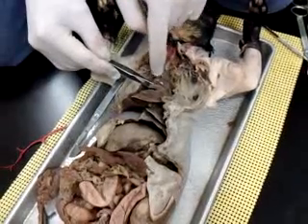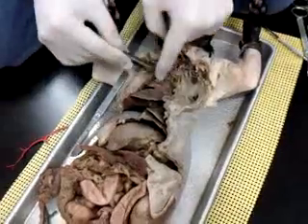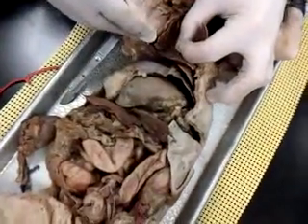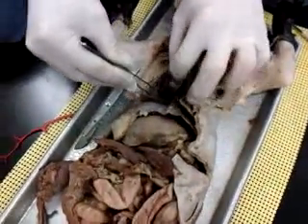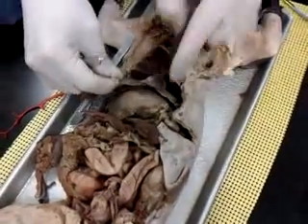The membrane that's on the organs itself? Visceral pleura. Then it folds back on itself and lines the rib cage here, what would you call that membrane? Exactly, parietal pleura. And what do you call this thing right here, you think? Diaphragm.